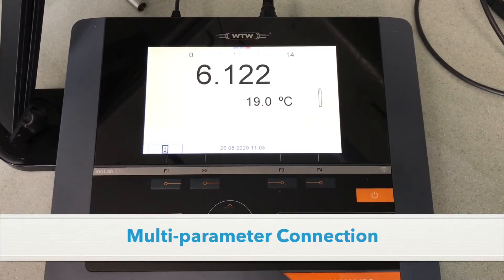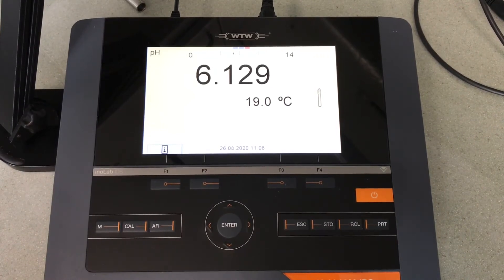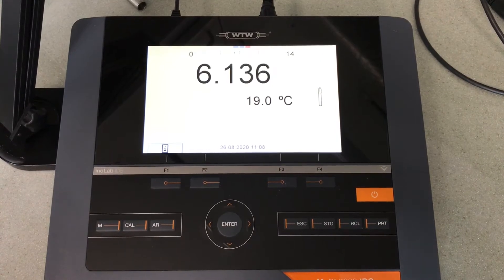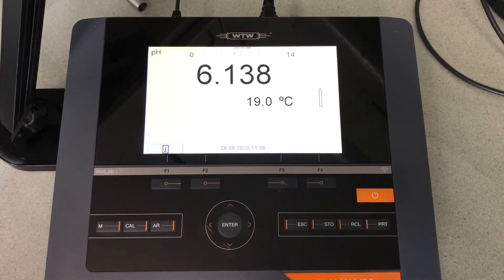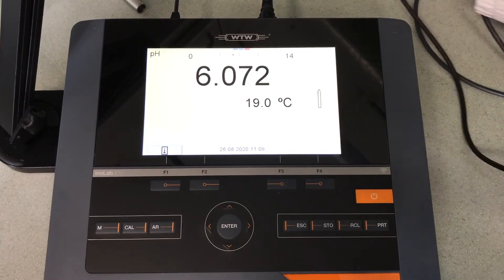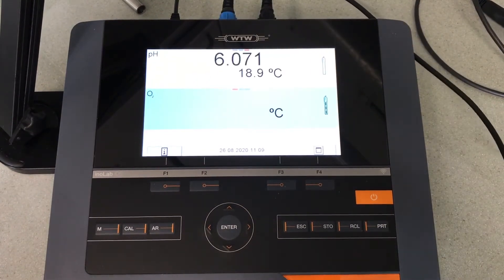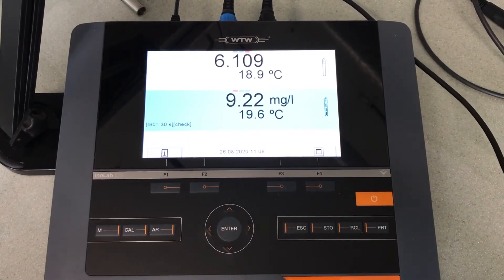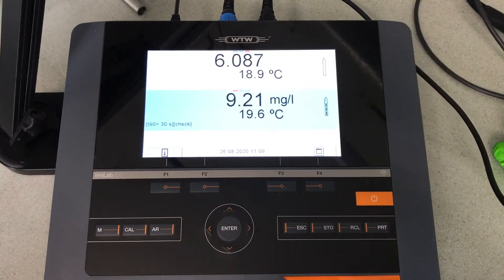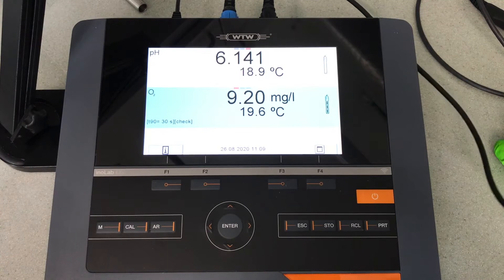Traditionally we think of having a pH meter, or conductivity meter, or dissolved oxygen meter. This meter actually is a combined meter able to measure all three of those, in addition to redox and turbidity. So you have one meter with three ports in the back, able to measure any of those five parameters in any combination simultaneously. I'm now going to plug the dissolved oxygen electrode into the back. The meter will now search for that probe, and the probe is telling the meter what it is. We've now got an icon that comes up — in this case we have three bars on the dissolved oxygen probe, saying it's in very healthy condition. It doesn't require calibration; if it did, the icon would be flashing.